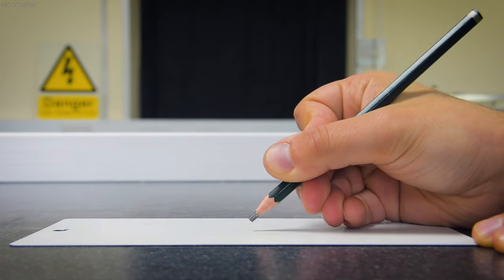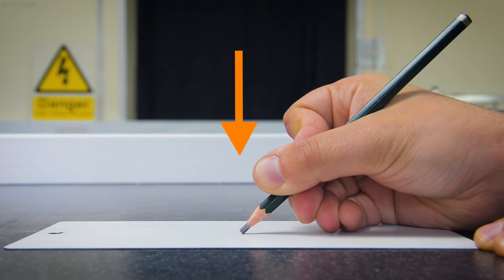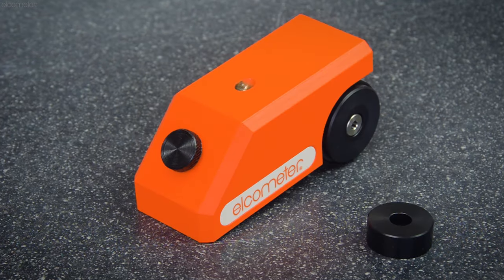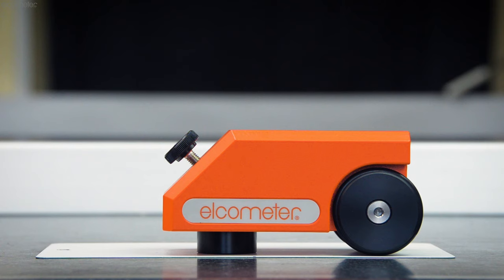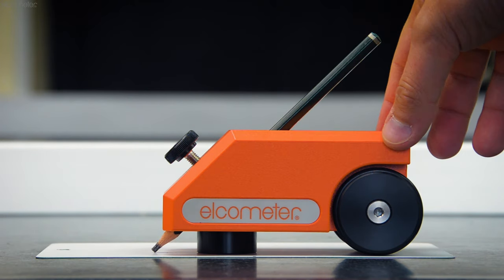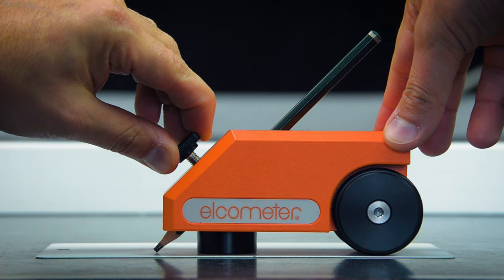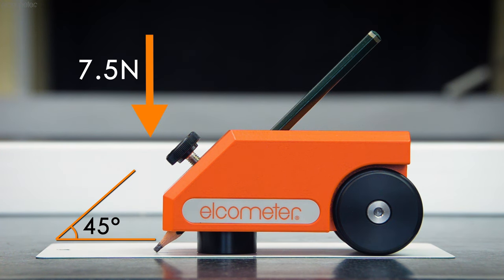Some standards, however, such as ISO 15184, specify the amount of downward force that should be applied to the pencil during the push. This is where the Elcometer 501 pencil hardness tester comes in. With the tester resting on the setting block provided, simply fit the pencil into the body with the tip resting on the surface, lock it in place using the thumbscrew, and your pencil is instantly held at 45 degrees under the predefined force of 7.5 Newtons.